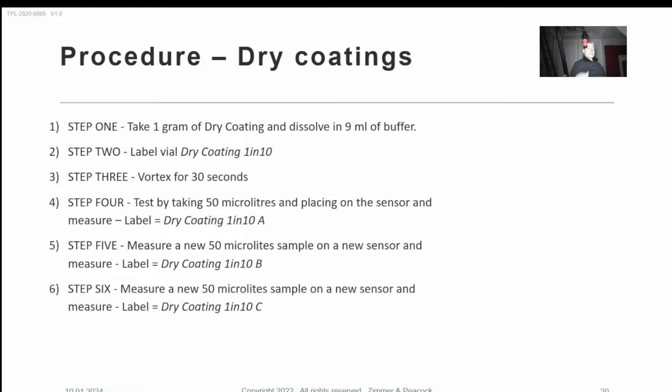The reason being is when you've got samples that are very heterogeneous, you can't take one measurement and say that's representative of the sample. You actually have to sample it a few times, because a sample taken near a powder will have a different hotness to a sample that's taken slightly further away from a powder. It's not homogeneous throughout.